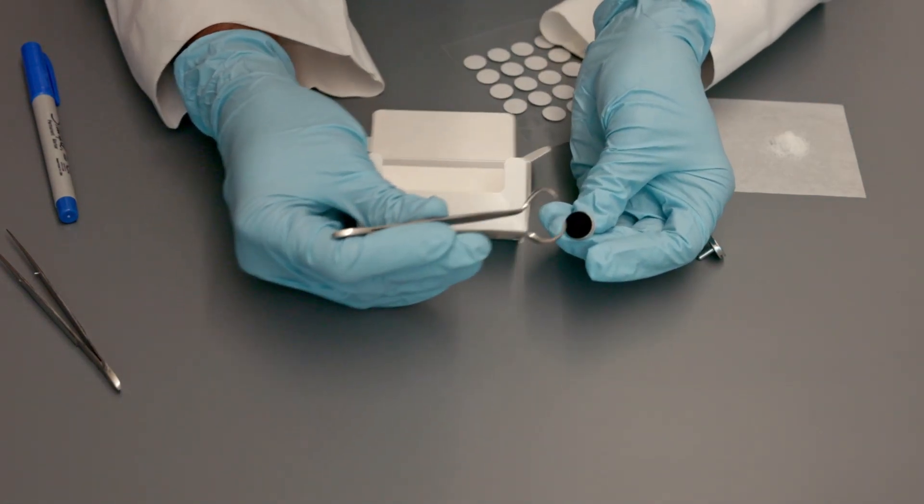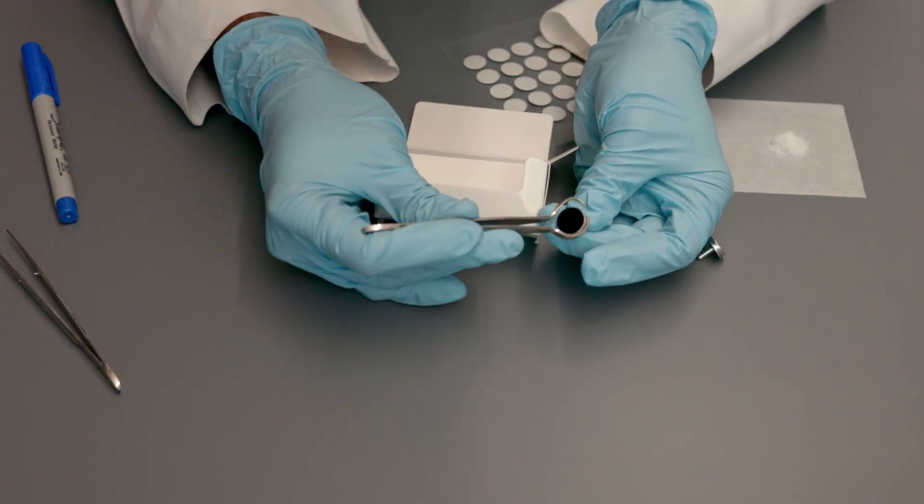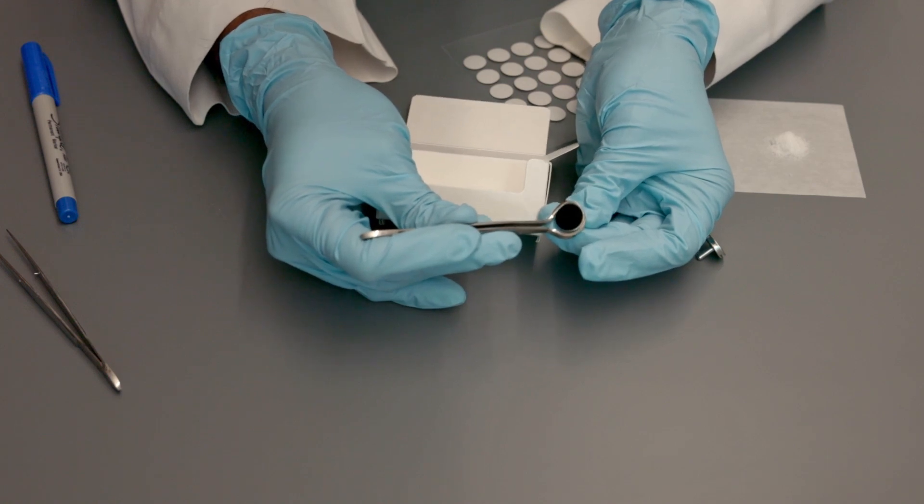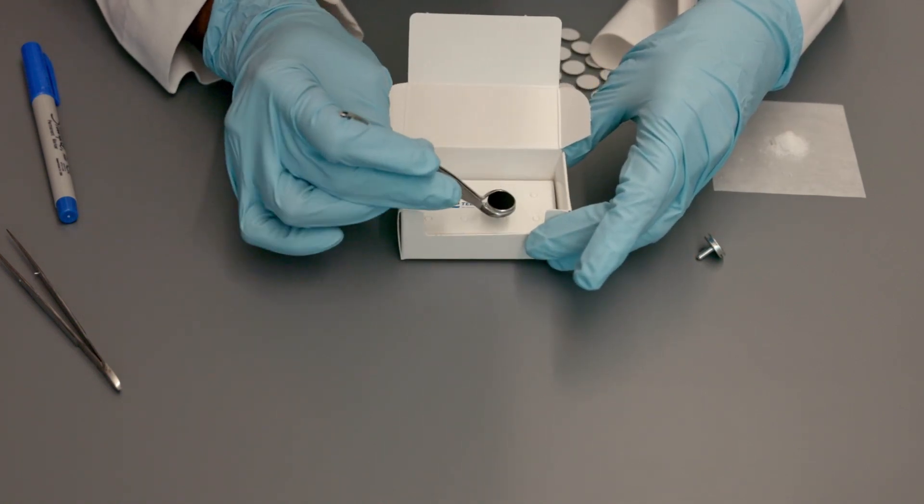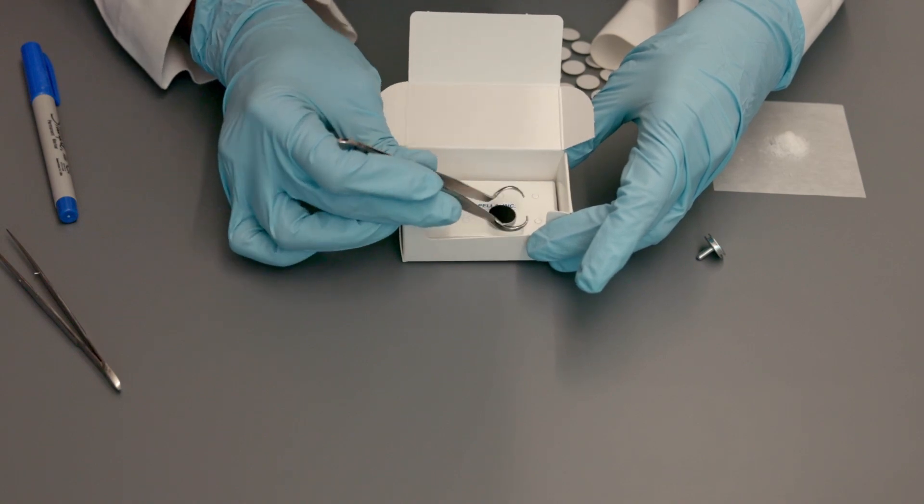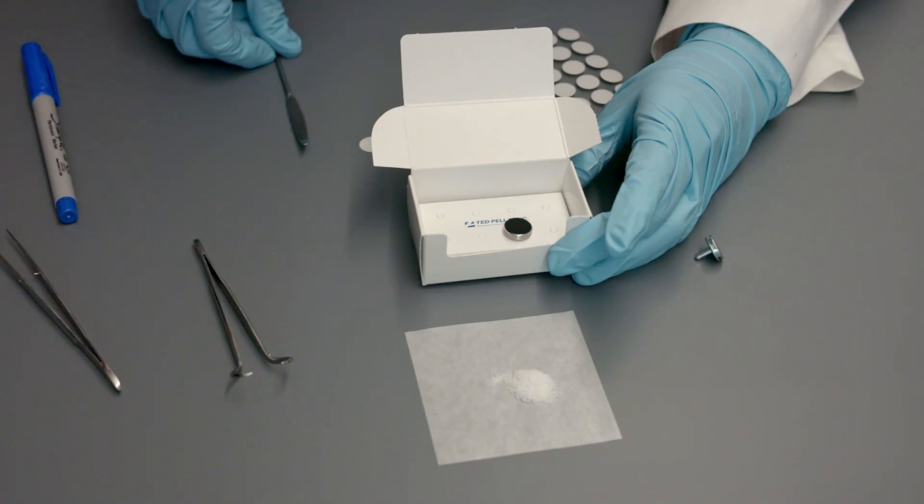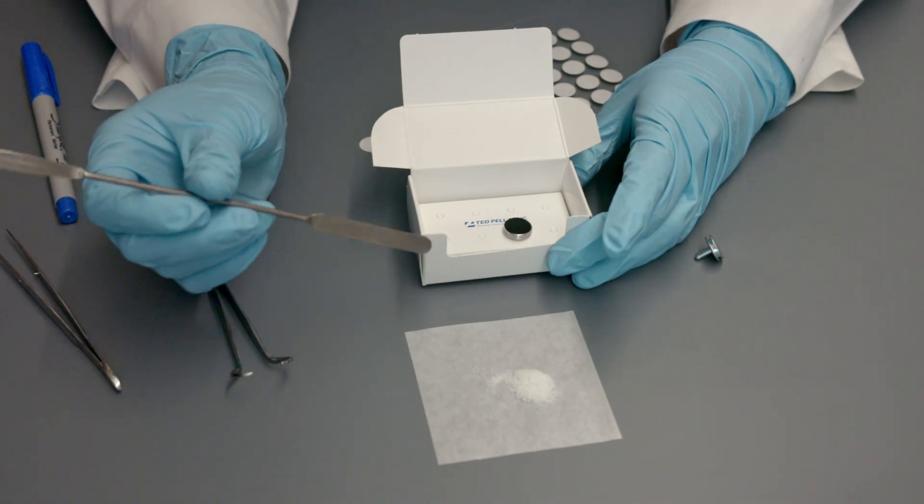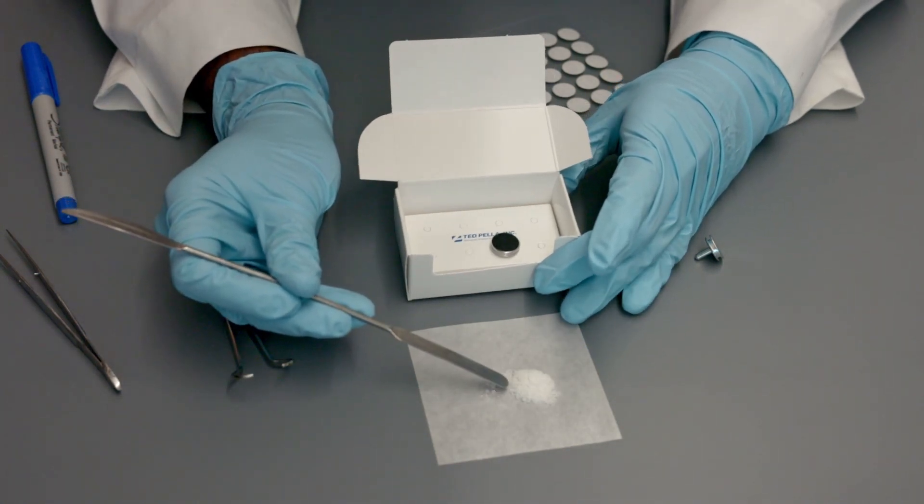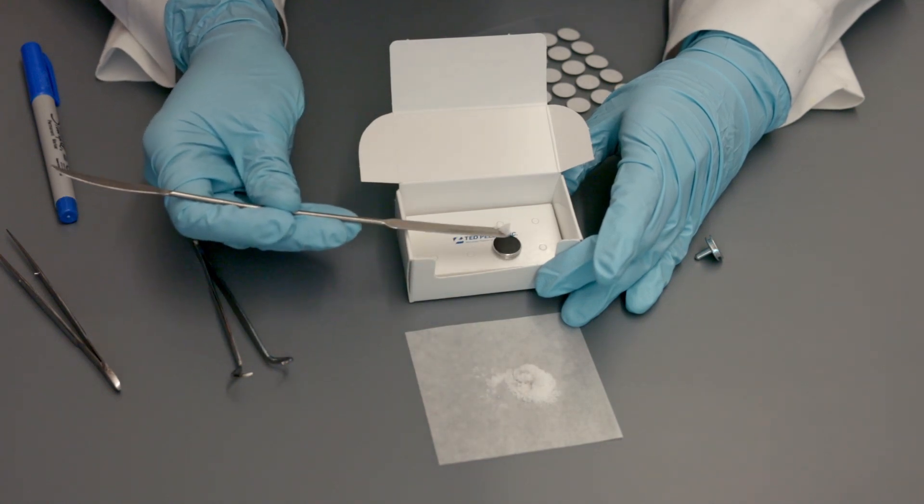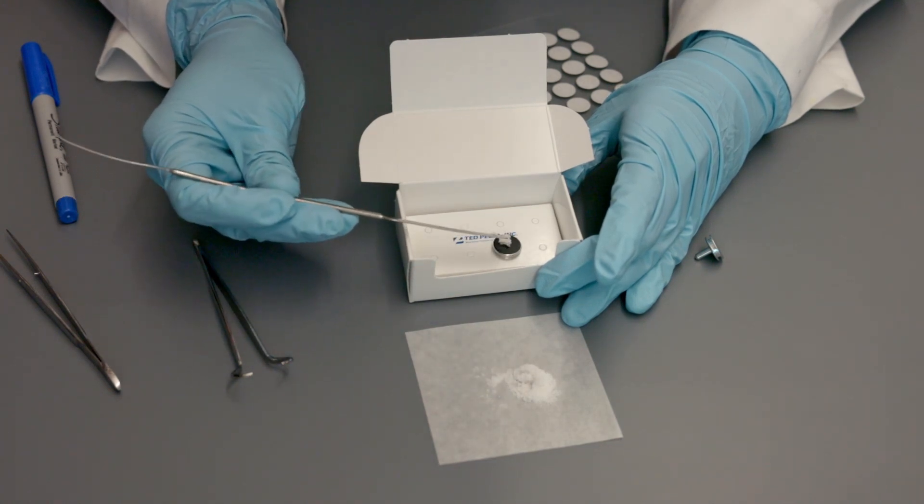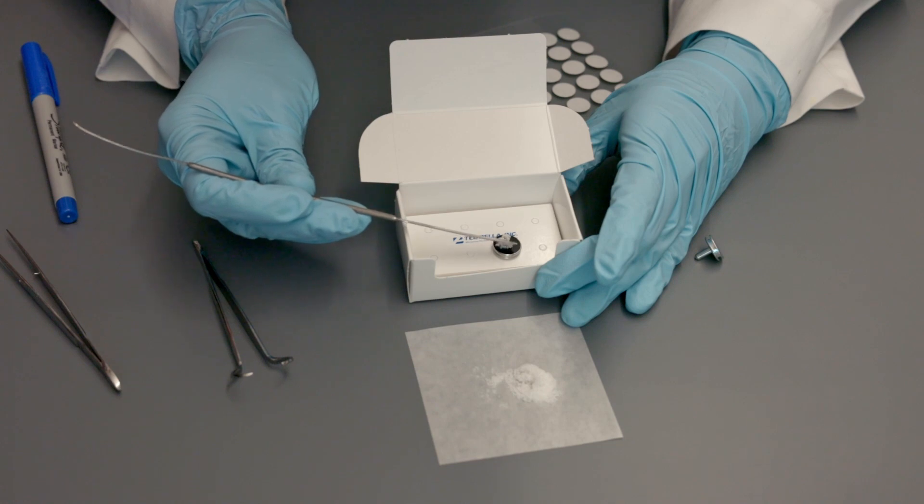Hold the mount using tweezers and place it on the insert. One of the samples we will be working with today is table salt. Using a spatula, add a small amount of sample on the mount and spread it.